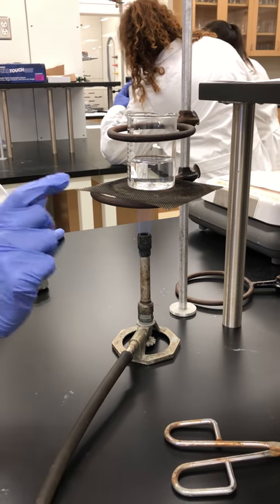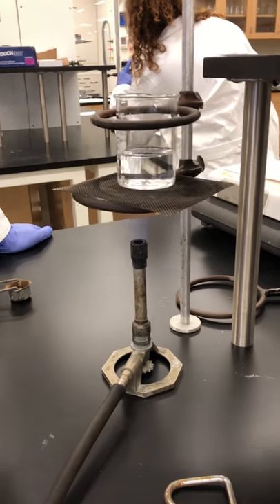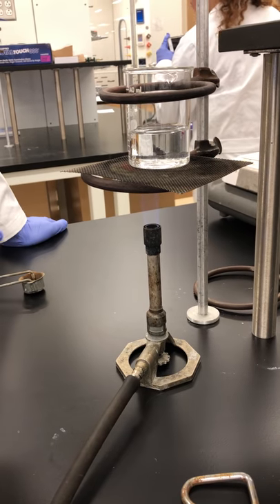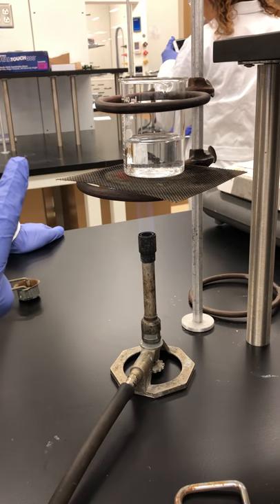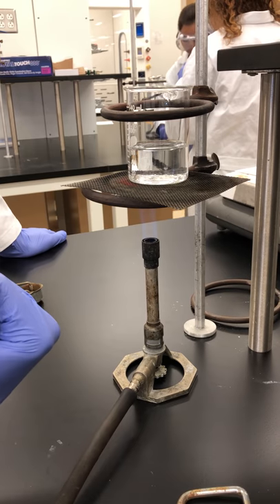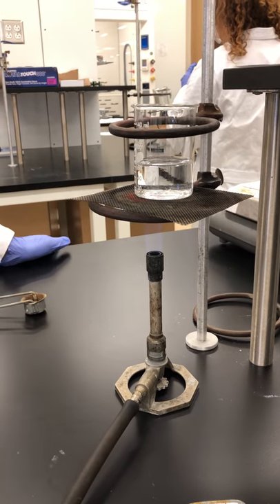Alright, so you can kind of start seeing some bubbles beginning to rise and form. A little bit longer. Alright, you can see some of the bubbles starting to rise and it's about to boil soon. Alright, the bubbles are rising — see, now it's boiling.